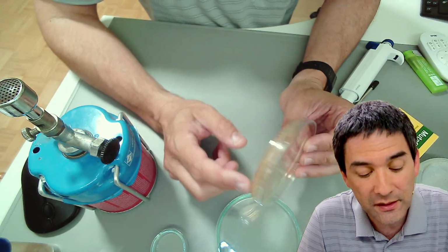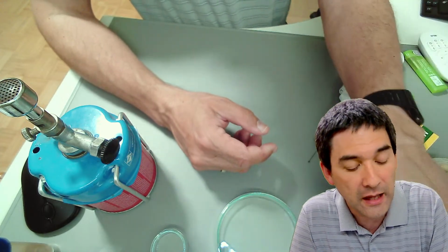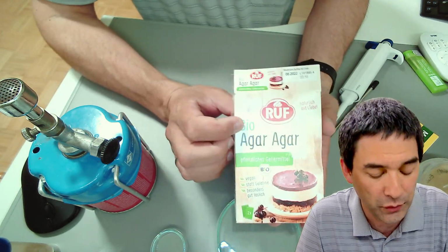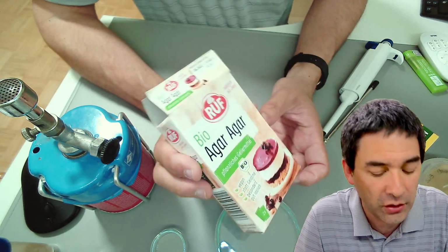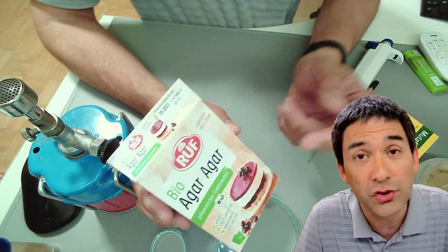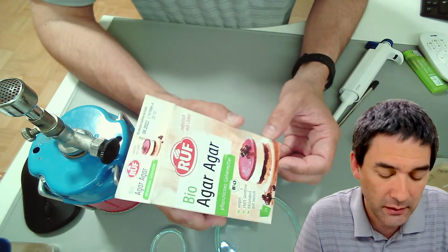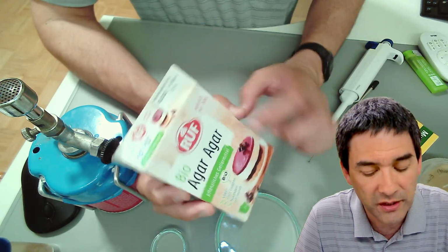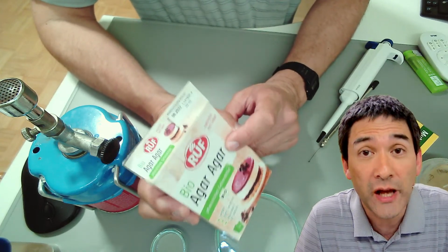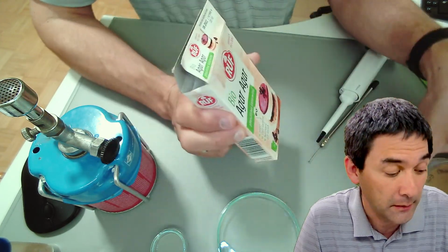The substance that is used to make this is known as agar, and it's also used for cooking. I actually found this one over here. This is not laboratory grade agar, but it's used for making cakes instead of gelatin, because gelatin is a protein from animals, and people who don't like that sometimes use agar, which is a plant-based polysaccharide. It has been used since the 19th century for making those agar plates.